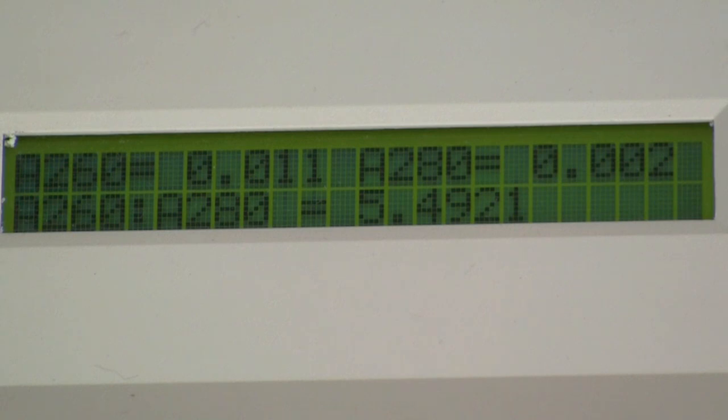Anything greater than 1.8 is pure DNA. Therefore, in this case, we have determined that we have purified plasmid.